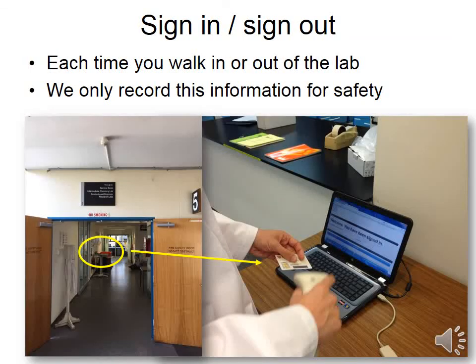One aspect of safety is that we need to keep track of who is in the lab at all times in case of an evacuation. We are doing this by having a sign-in, sign-out computer where you can scan your student cards each time you walk in or out of the lab.